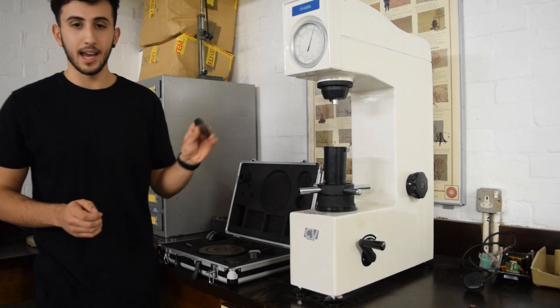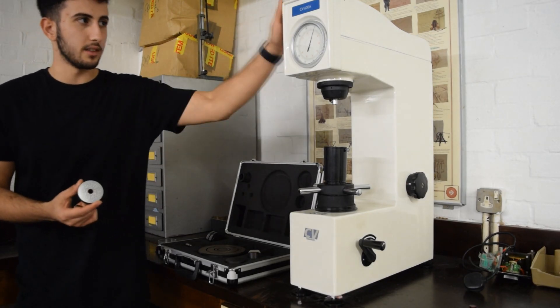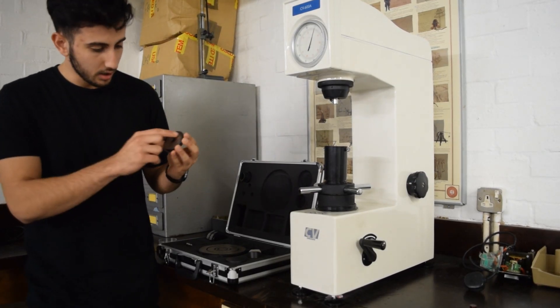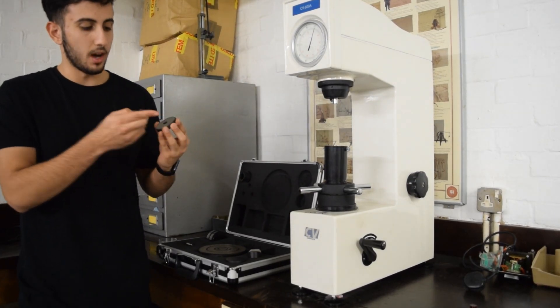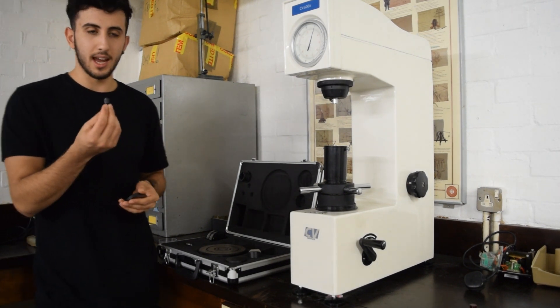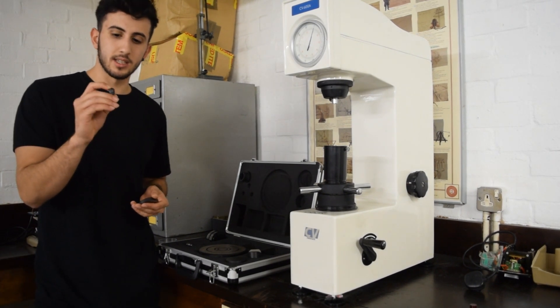A material like mild steel is used as a calibration test piece to check that the machine is in order and is up to calibration. It's got numbers written on it that specify its actual hardness. Since this is mild steel, we'll be using a Scale B indenter with a steel ball.